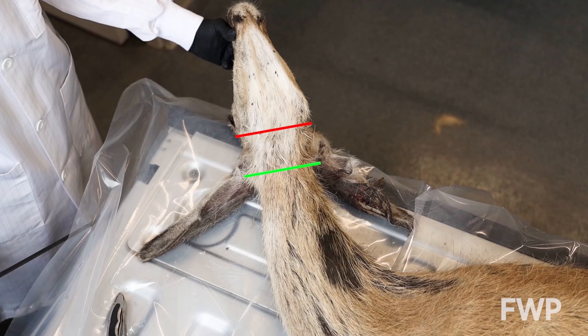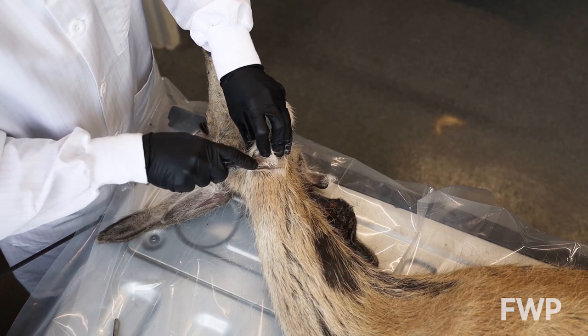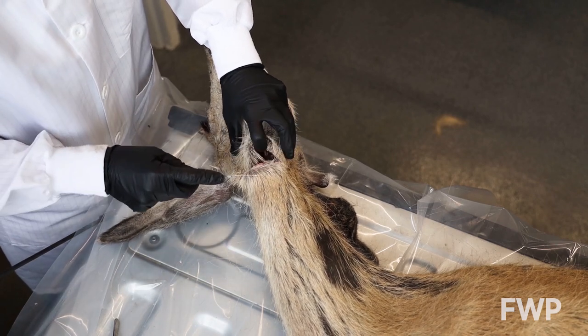Cutting too closely behind the jaw may leave the lymph nodes in the larger portion of the carcass, making them harder to find. Make an incision perpendicular to the neck. Cut through the windpipe and angle downward toward the back of the ears.